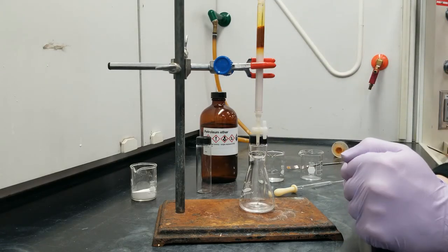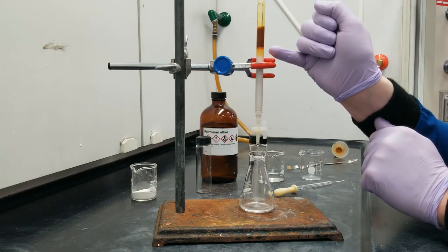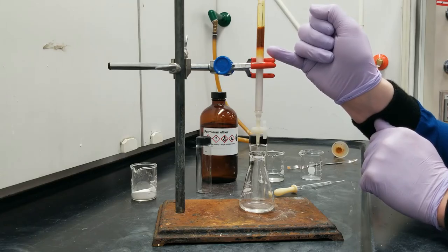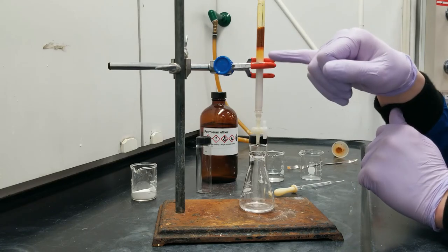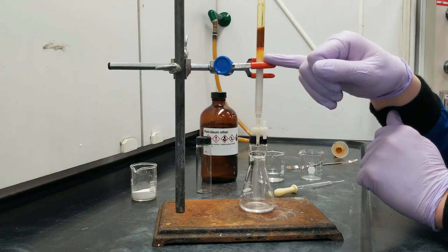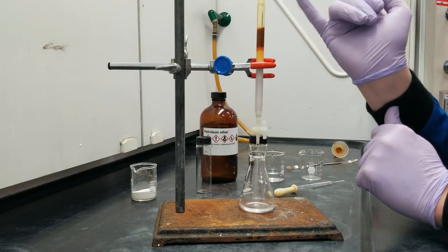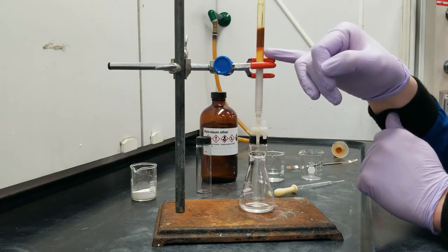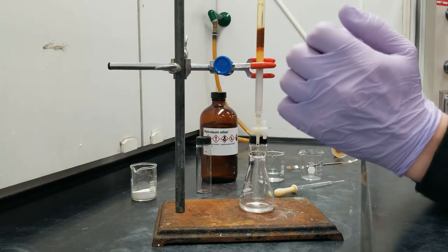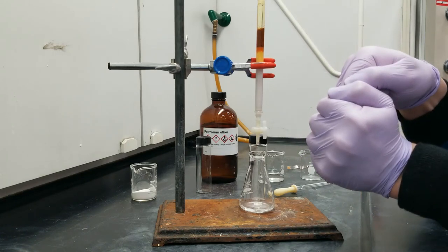Immediately, what I hope you guys can see is I have a light yellow colored compound which is rather quickly making its way down the column, and I have a darker orange compound which is just staying right here at the top. So this lighter yellow compound, that's my ferrocene. It's really nonpolar, and so this relatively nonpolar petroleum ether can carry it down this column. However, the acetyl ferrocene is so polar and it's so tightly fixed onto the alumina that the petroleum ether is not polar enough to push it down.